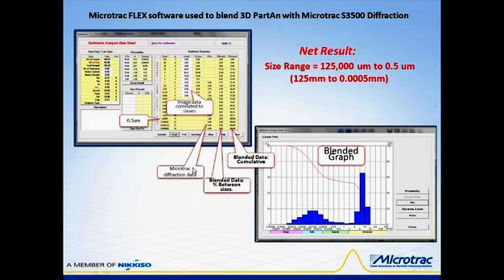The tabs at the bottom provide us with a couple of features. One is to perform the calculation, and this tab is shown as Calculate at the bottom. And then once that calculation occurs, which takes on the order of a couple of tenths of a second, then the next thing that happens is that all the data on the right side of the table is developed. And what we find is that we have the Microtrac diffraction data that's been extracted.